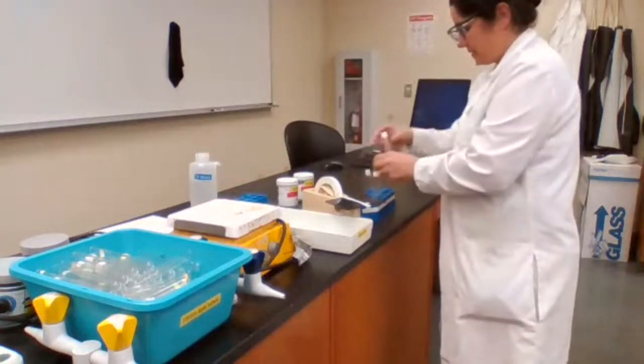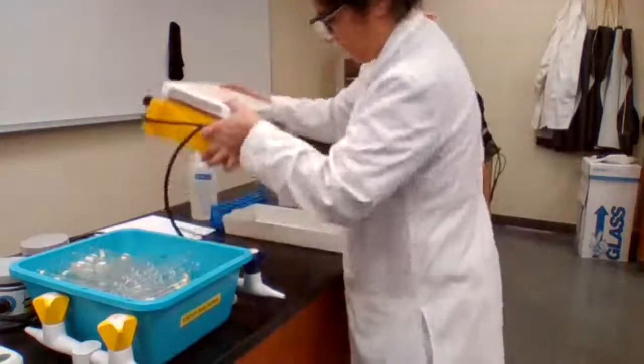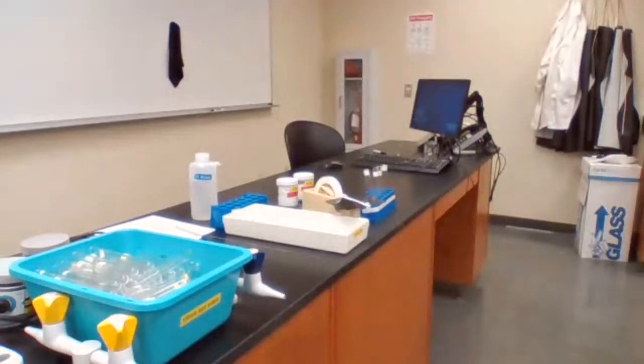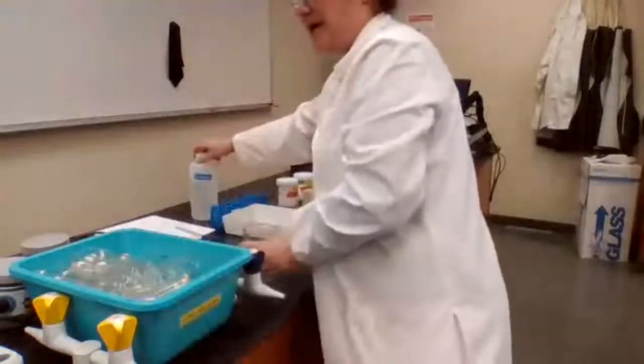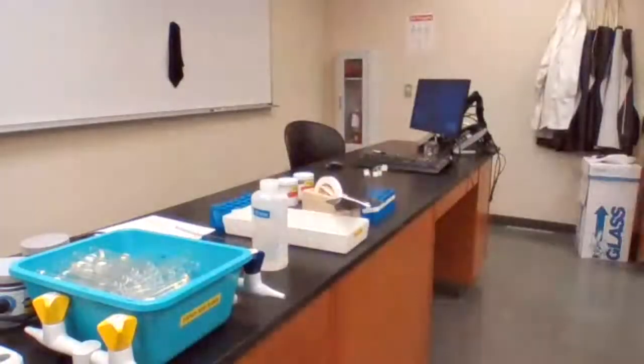I think it's better for me to start the hot water bath as well, so that when I have the test tubes, I also have the hot water.